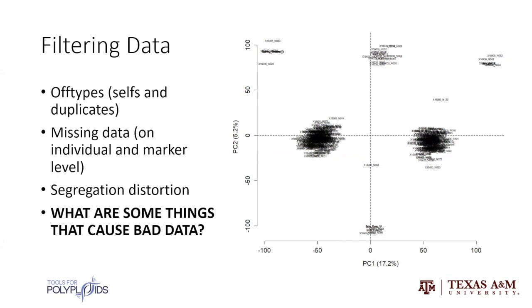If there are odd markers scattered around, single markers, then probably not. I think that if you can distinguish what's biological and what's genotyping error, the biological segregation distortion should not distort your map too much. The map will be built fine, but because we cannot distinguish, you probably have bad maps if you keep the segregation distortion markers there. Okay, yeah, thanks.